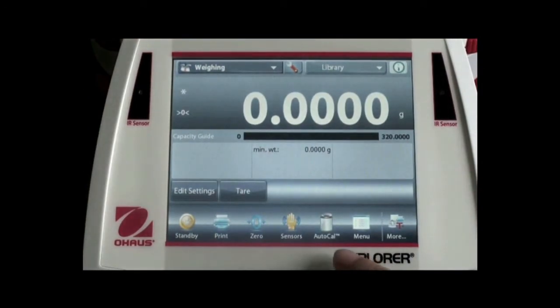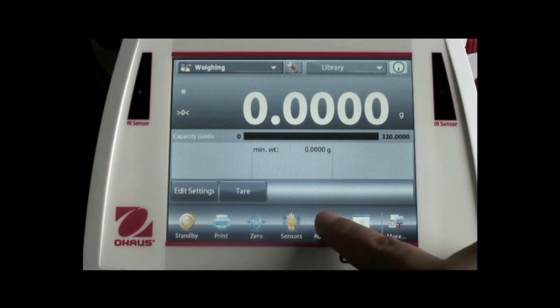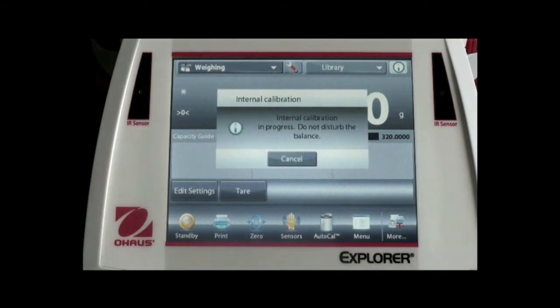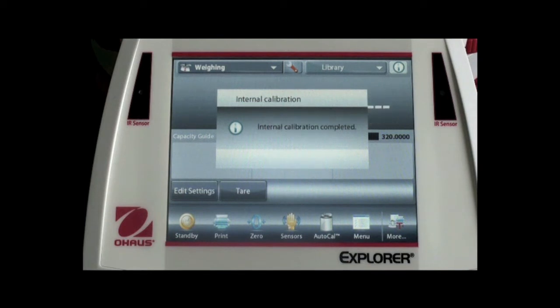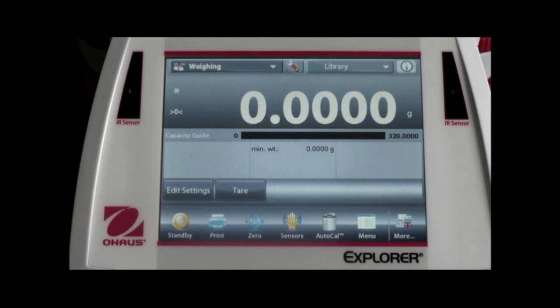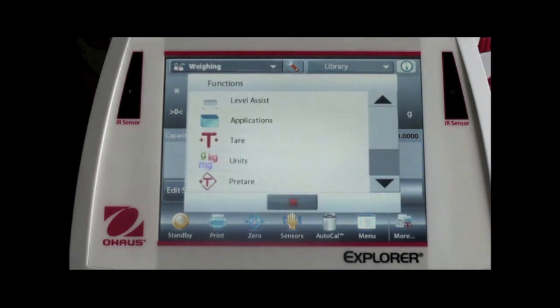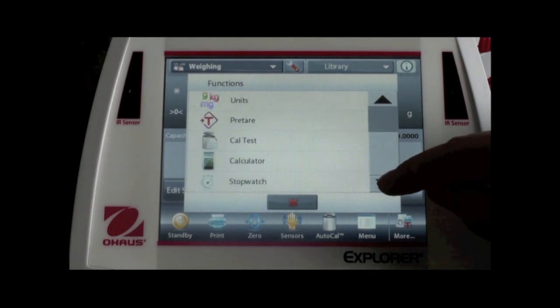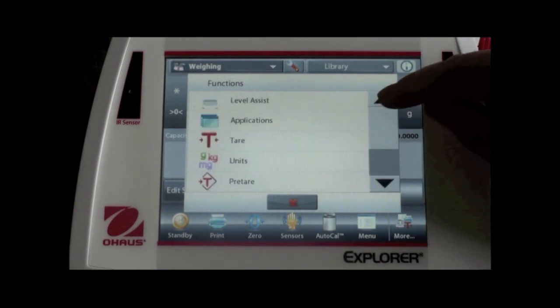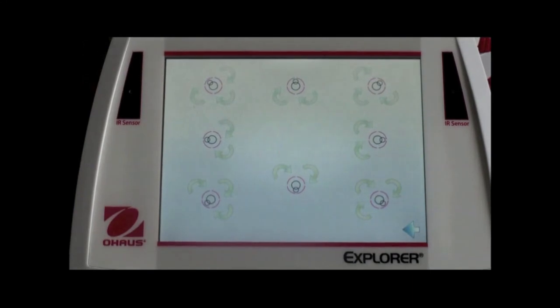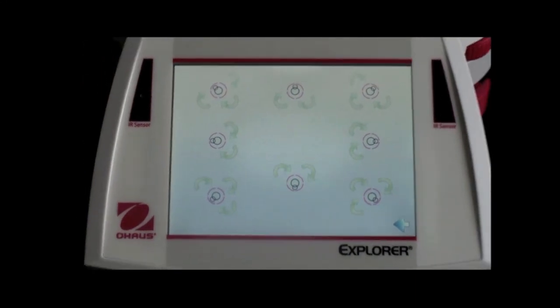We also have an AutoCal function that enables the balance to run internal calibration automatically. The last button, called More, includes other frequently used buttons which are not listed on the main screen. For example, when you press More, it shows the other eight functions. The Level Assist function is used to help level the balance before use. The picture identifies which feet should be adjusted and in which direction.